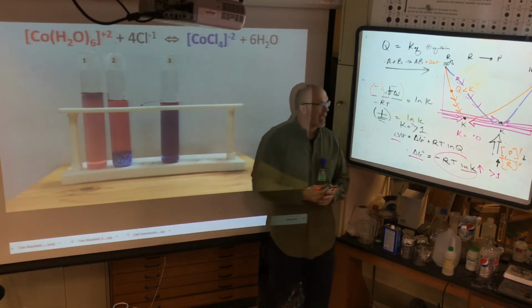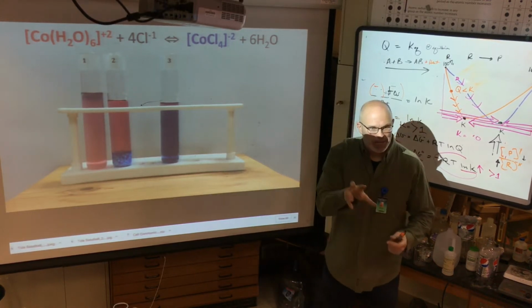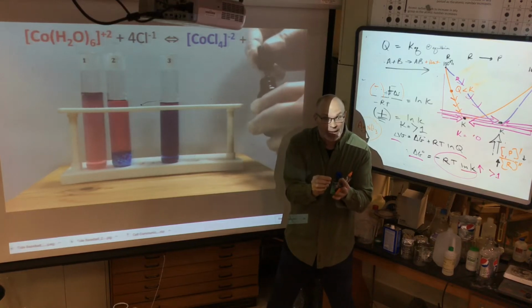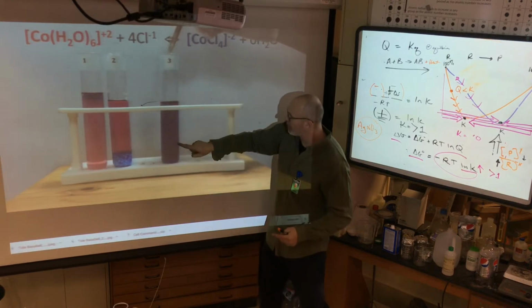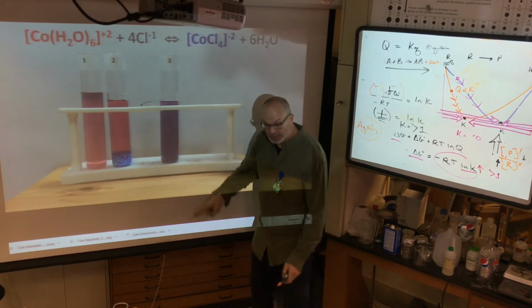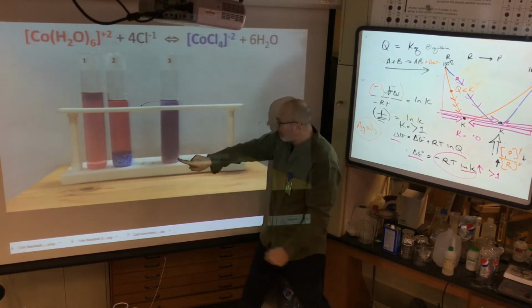What's cool is I'm going to add silver nitrate here. AgNO3. What does this break apart into? Ag plus. And Ag plus is insoluble with the what? So by adding Ag plus, I'm making a precipitate, and the precipitate's going to take out the chloride. Watch the solid appear. See the solid start to appear? Remember the yellow stuff that became a solid? A precipitate is occurring. What does that mean? The chloride ions are attracted to the silver plus, and they're making an insoluble compound.